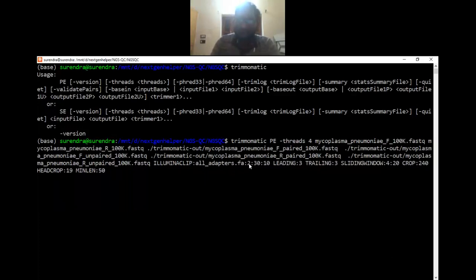Then look for two mismatches when you align the adapters.fa sequences. Then use a 30 quality score for the paired end sequences and 10 for the single end sequences. If they align well with 30 or 10, for paired end and single end respectively, then trim them, because that is coming from this particular adapter sequence.